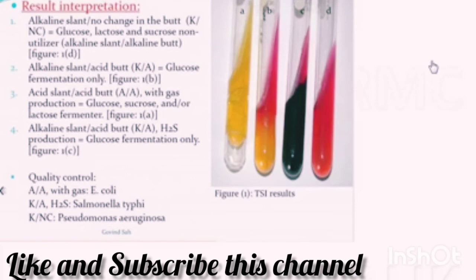And in the first tube you can see that the whole thing, the butt as well as the slant, has turned yellow. So everything is acidic now and there is production of gas. This shows that there is a glucose, sucrose and lactose fermenter. The first one with acid slant and acid butt and having gas will be E. coli. This one which has got an alkaline slant with an acidic butt having H2S production is Salmonella typhi.